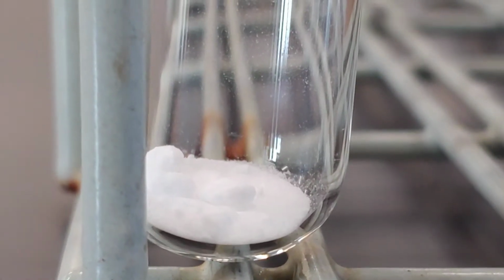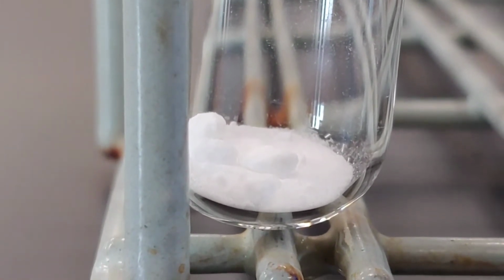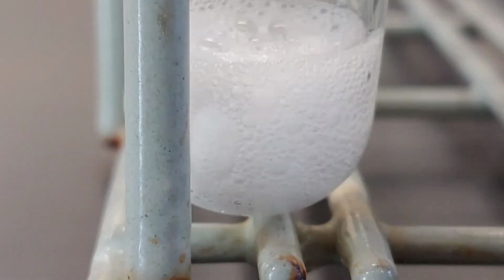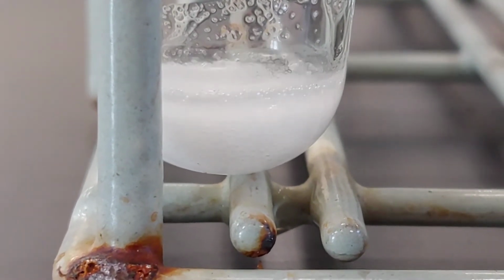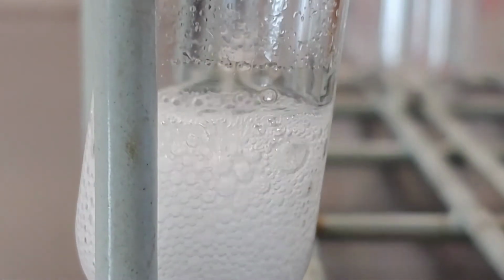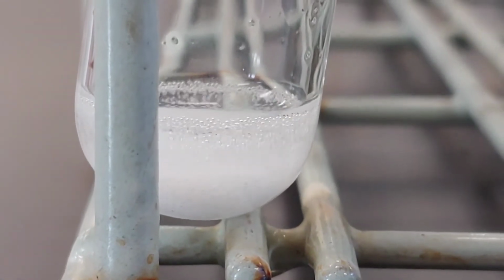Okay, now we're moving on to reaction number 5. This is solid sodium bicarbonate, and I'm going to add acetic acid. Sodium bicarbonate plus acetic acid. All right, reaction number 5.